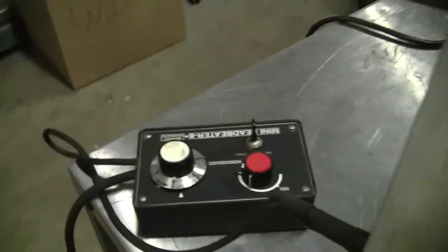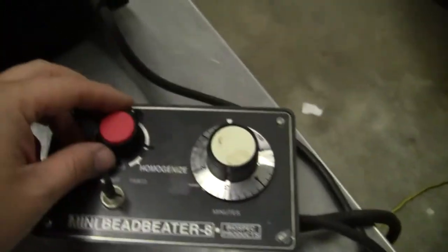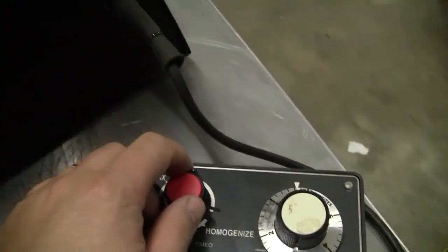The unit operates at 115 volts. The controller unit has a timer and a variable speed controller. I'm going to put it on. Using the knob, I can vary the speed of it.